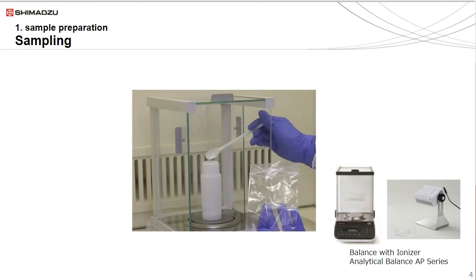Most pharmaceutical samples do not dissolve directly, even in strong acid solutions. Samples must be decomposed in pressurized microwave digestion vessels, usually made of Teflon. These vessels are reusable and hold the sample, acid, and other reagents for digestion. They are sealed and subjected to microwave radiation to produce heat and pressure, which renders the contents soluble in water while retaining the elemental compounds.